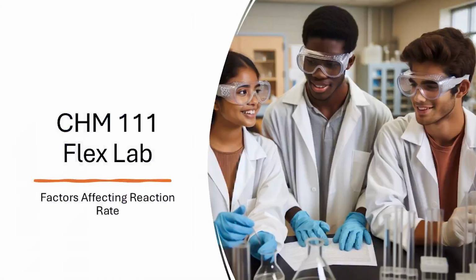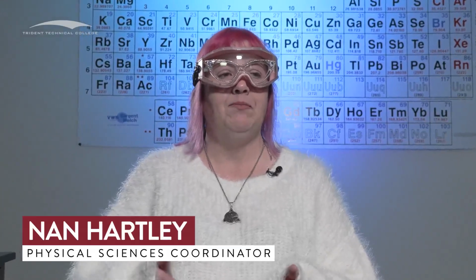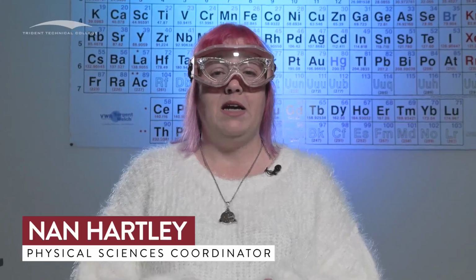We're going to talk now about the experimental side of factors affecting reaction rates. When we talk about this lab, all of the information that you need is in the lab manual. It will tell you exactly what equipment you need other than what's in the kit. Make sure that you follow the directions carefully from the lab manual. Make sure that you label all of your beakers so that you know exactly what chemicals you're working with.